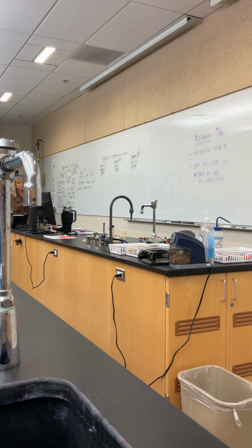Okay. So in this case, I'm getting a difference based on whether I'm able to eat the sugar lactose. If I can eat a lot of lactose, I make a lot of acid, so my color is going to shift to a pink colony. So look at your E. coli. Does it have a lot of pink colonies? They almost look like Pepto-Bismol. That's the distinctive E. coli color, a pretty pink colony.